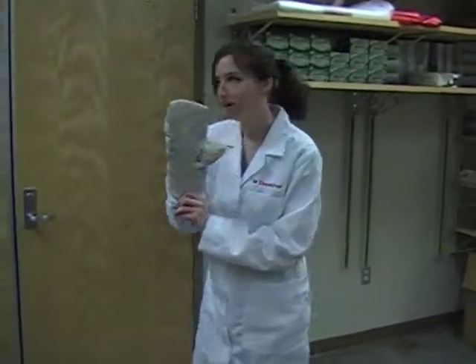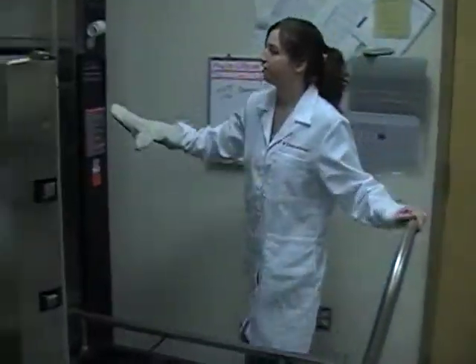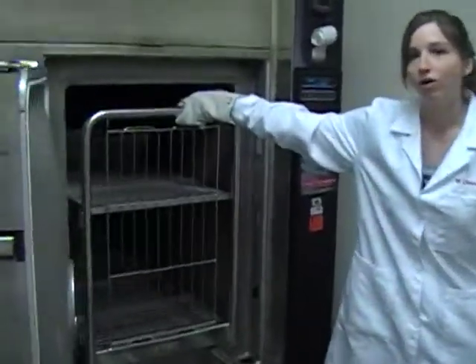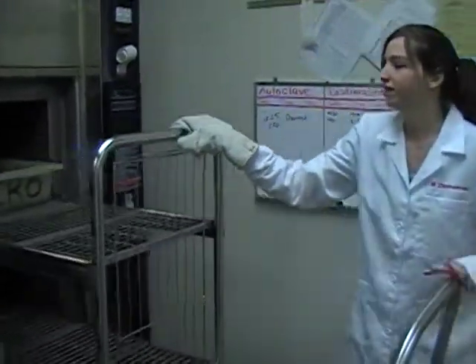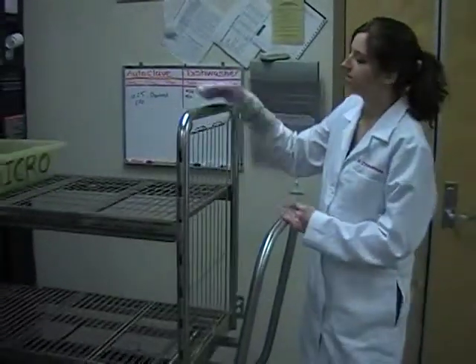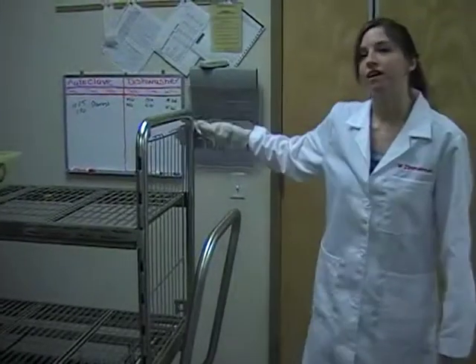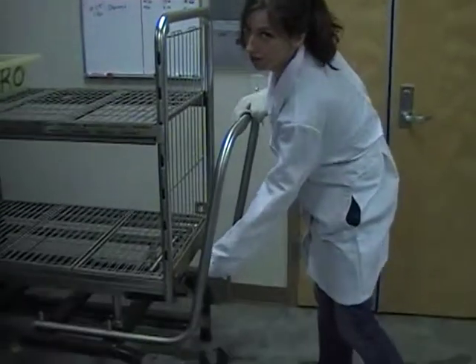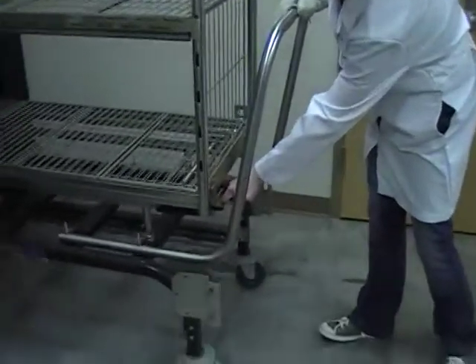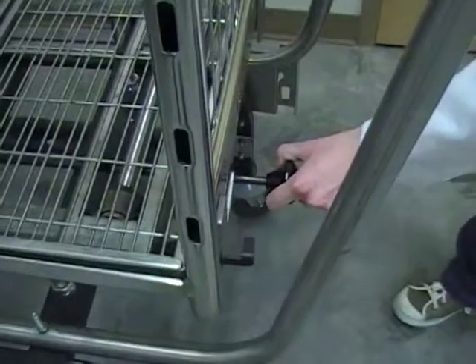Once you have a secure fit, put your autoplay glove on and pull out the cart. Always make sure you have the autoplay glove on. This metal has just been in about 121 degrees Celsius, so you don't want to put your hand onto it because you can burn yourself. Simply pull on the inside to release the cart from the autoplay.